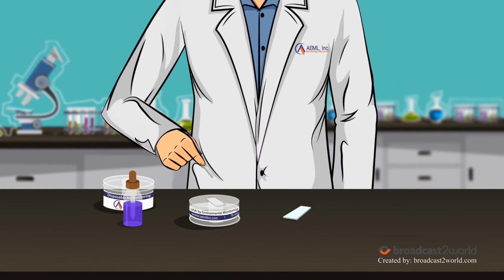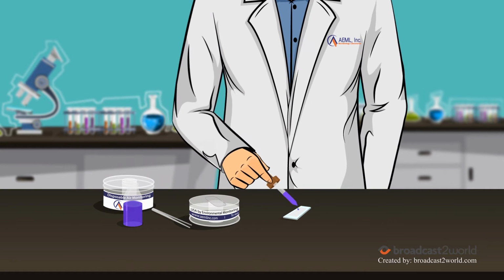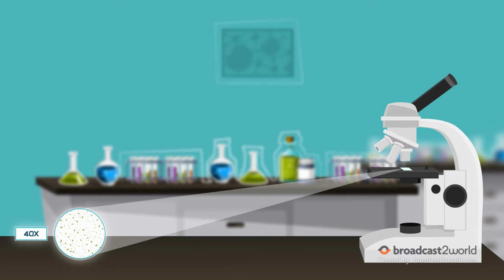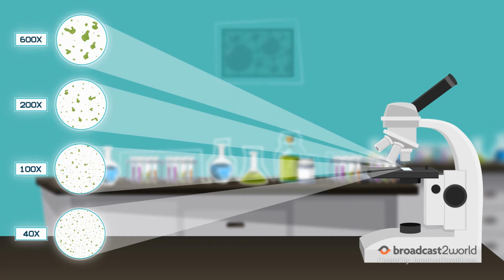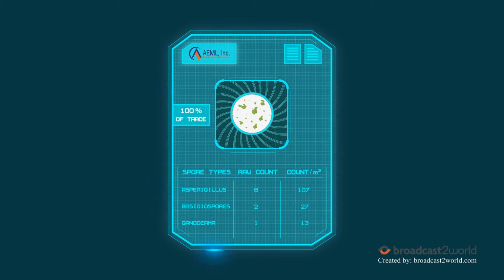The lab technician removes the sticky glass slide from the spore trap, adds a colored dye to make the objects more visible before placing it on a full slide. To analyze the trace, a light microscope is used. Since the mold spores are very small and often clumped together, a magnification of 600 is needed to see them. The entire trace must be analyzed at this magnification to ensure no mold spores are missed. This is the best quality analysis and is referred to as 100% analysis at 600x.